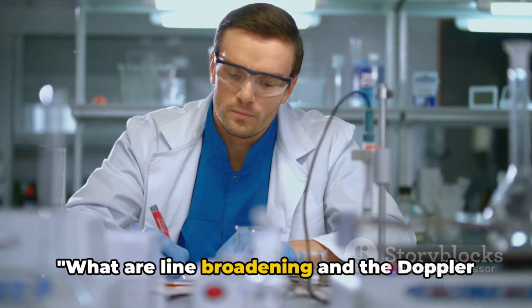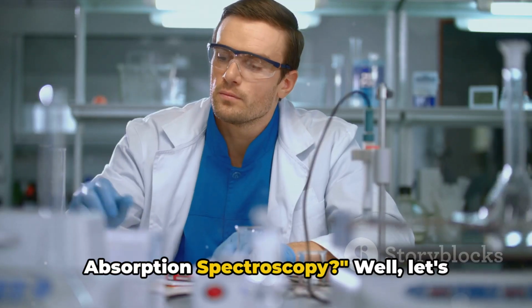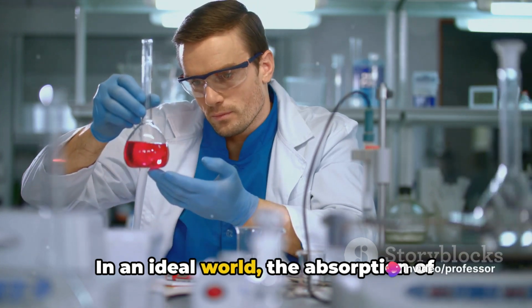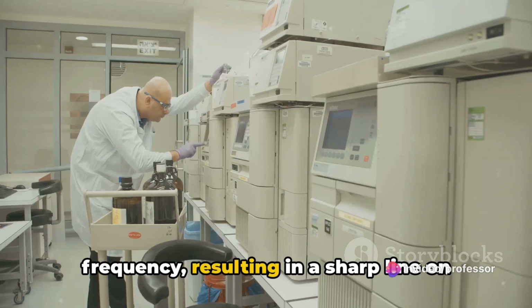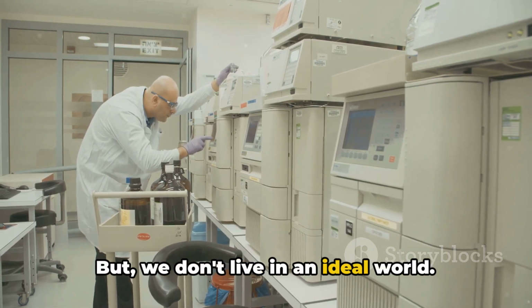What are line broadening and the Doppler effect? And how do they impact atomic absorption spectroscopy? Well, let's start with line broadening. In an ideal world, the absorption of light by an atom would happen at a precise frequency, resulting in a sharp line on the absorption spectrum. But we don't live in an ideal world.